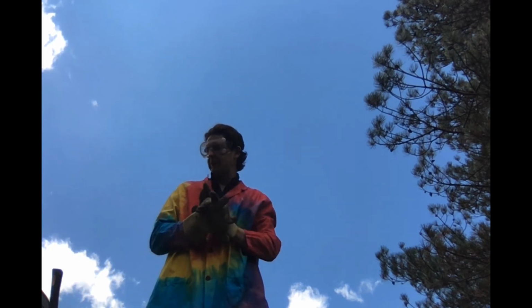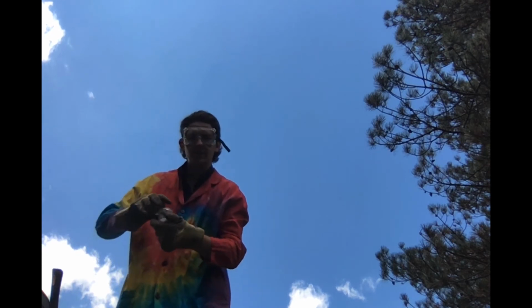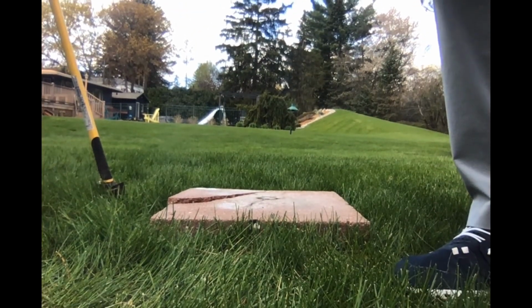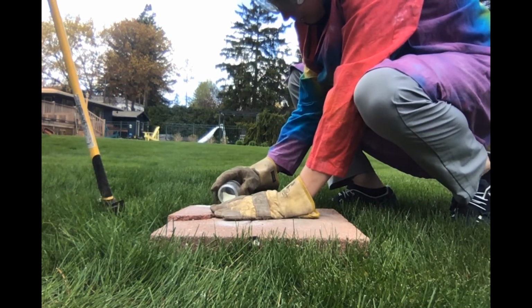Let's have a little bit more fun with this stuff. If some is good, more is better. Wise words of Mr. Ray and Mr. McCollum. So we're going to do that right there. I'm going to add just a little bit more.